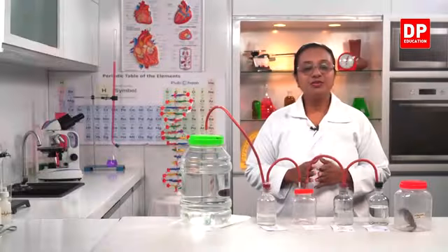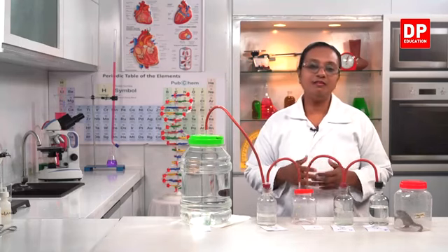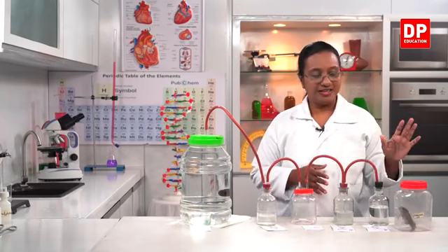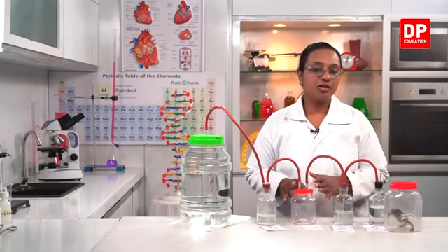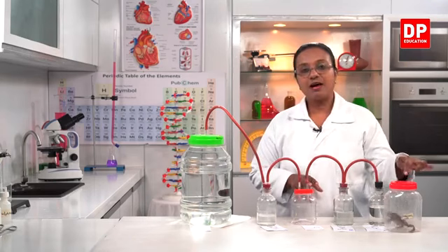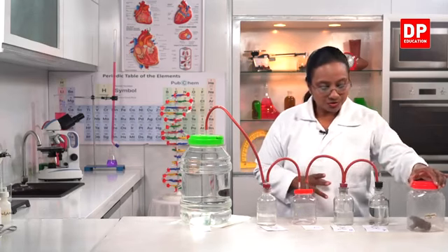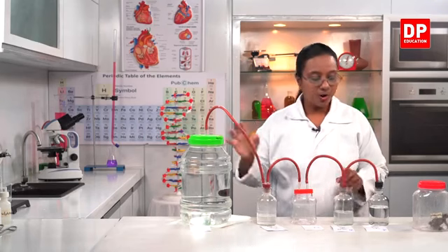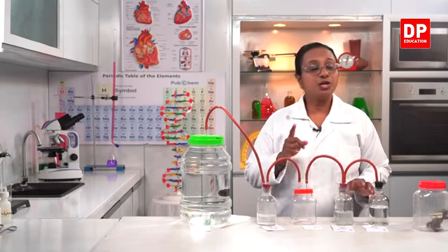So now we are going to do this activity to observe that carbon dioxide is released during respiration. To do the respiration, I have a frog here. So you can see it's a live frog. So I will have to transfer the frog into this bottle just before I start the activity, because there are holes here, so the frog will be fine and alive. So you all know, students, here we have 5 bottles including this large bottle. First one, bottle A, contains potassium hydroxide. You all know the purpose.